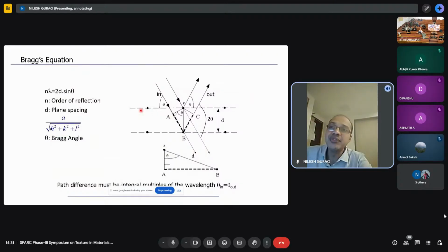When I talk about diffraction, we know the Bragg equation, lambda is equal to 2d sine theta. But when you talk about electrons, be it in a TEM, which operates at 200 kV, or electron backscatter diffraction at 20 or 25 kV, it's not just diffraction as a single event. It's a multiple event. So not our Bragg law.